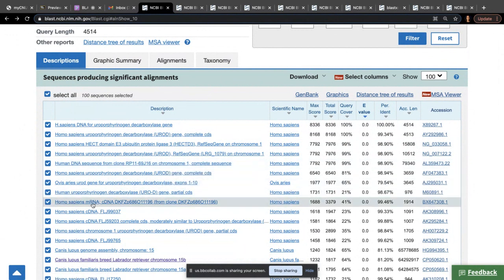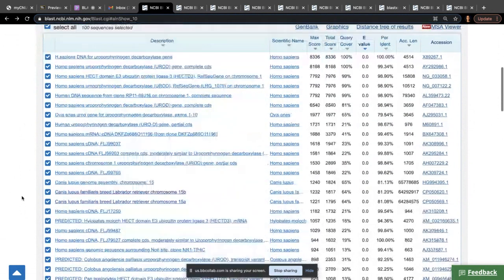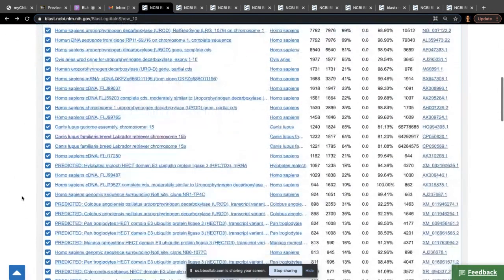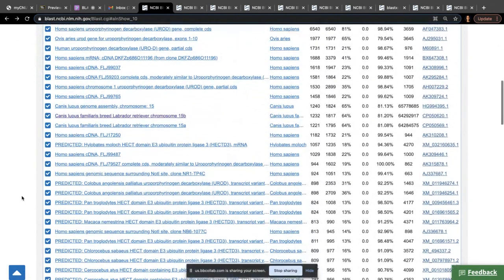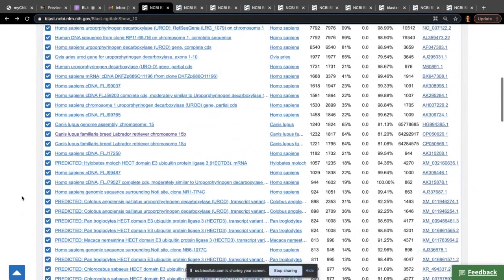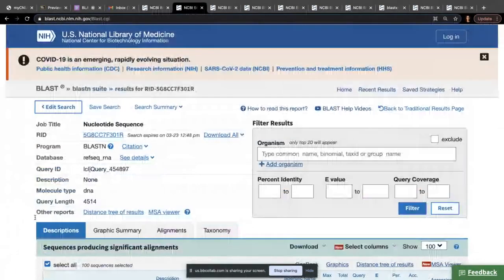So the same thing. Oh no, actually this one is mRNA. So that one is telling me that it's transcribed. Let's see what else is not very informative. So this one is when I searched the database and I didn't narrow down to mRNA. So let's see if my result for mRNA is ready. Good, yeah. And how do I know that that's the one? I don't have so many windows open. So here, reference sequence RNA.